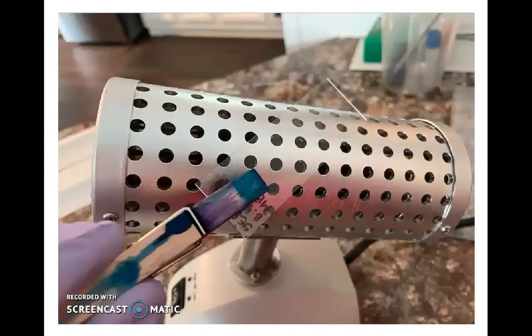Now, one other thing to know about heat fixing: you never heat fix your slide until it's dry. So once you put your bacterial cells onto your slide and spread them out, you've got to allow that slide to dry completely before you heat fix it. And that's because if you lay a wet slide against this hot incinerator, you run the risk that you're going to aerosolize that liquid very quickly, and you're going to send bacteria up into the air. And you don't want to do that.